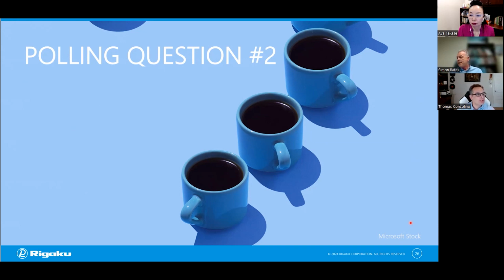The next question, I think this is a database question. Jennifer is asking, is there a database of bonds within the SmartLab software to determine the bonds, or do you have to know what elements are in the material before you search for the bonds? So I think she's going from the right search match to bonds, right? SmartLab Studio II will let you know where the peaks are in the PDF. But to identify them as cobalt, oxygen, or something like that, it needs a model. You're right, so you have to have a model in there.